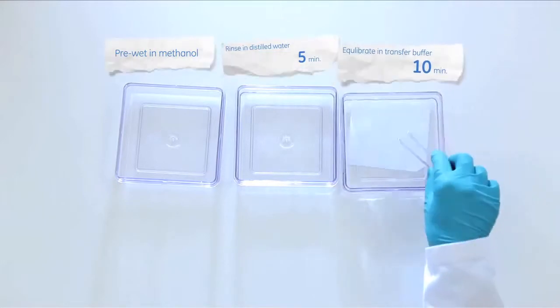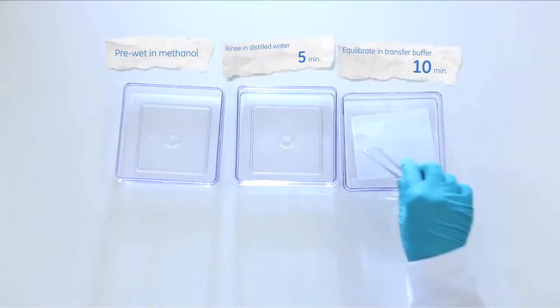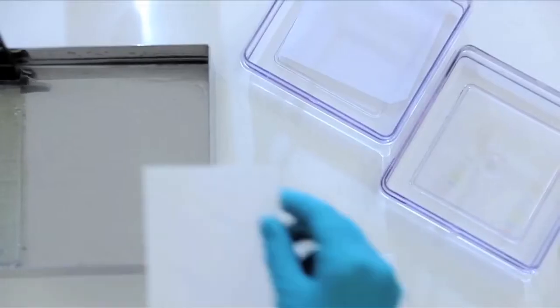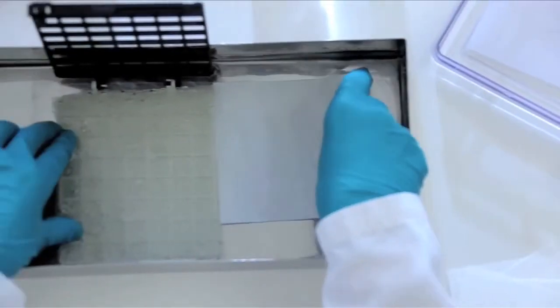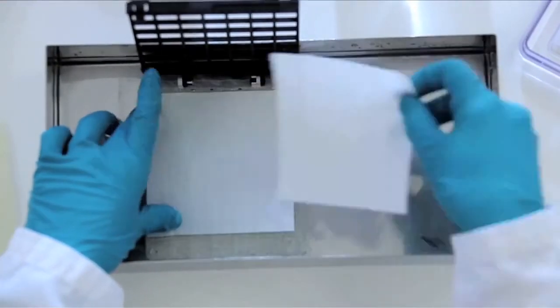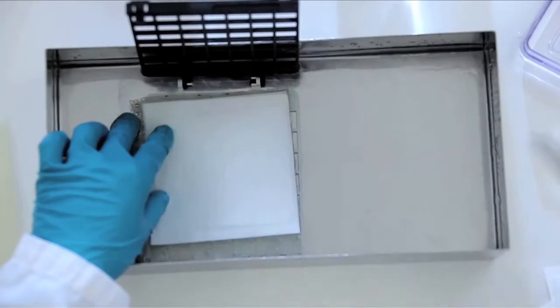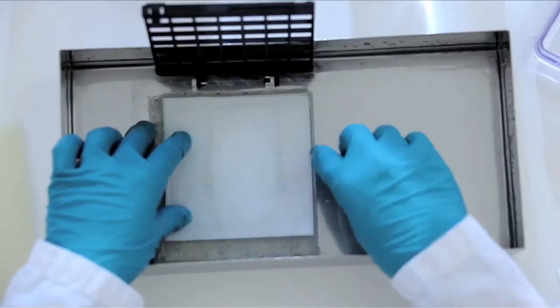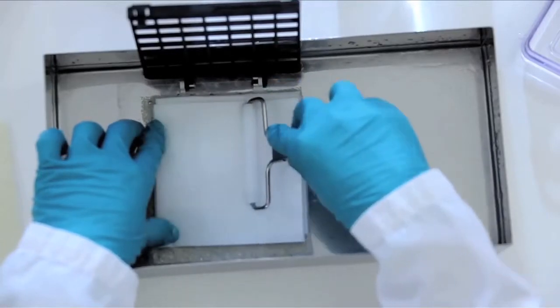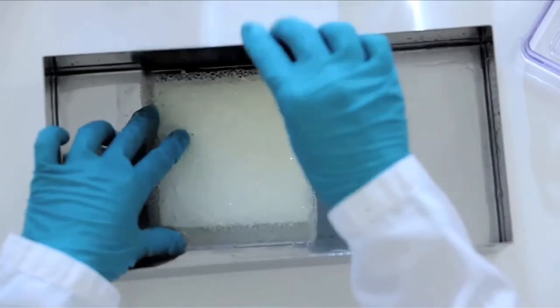Always use a blotting membrane of the same size and shape as the gel and the correct size for the frame. Build the sandwich carefully using two papers pre-wetted in transfer buffer on each side of the gel and membrane. It is important to remove all air bubbles from the sandwich. Carefully use a roller or a cut-down pipette or glass rod to squeeze them out.